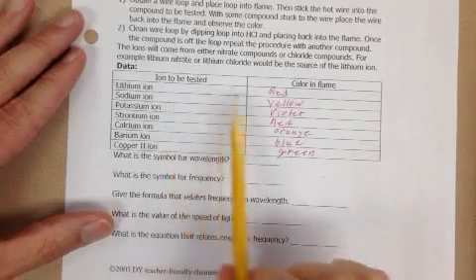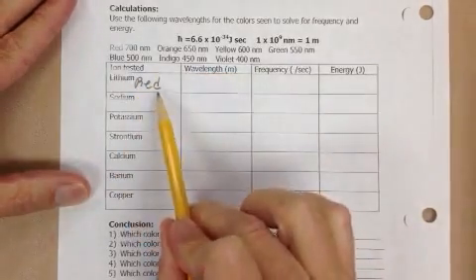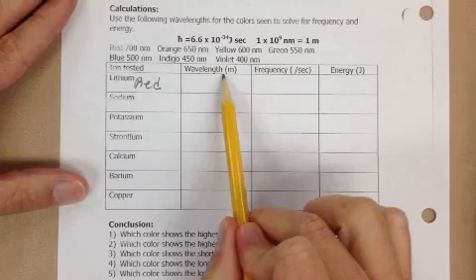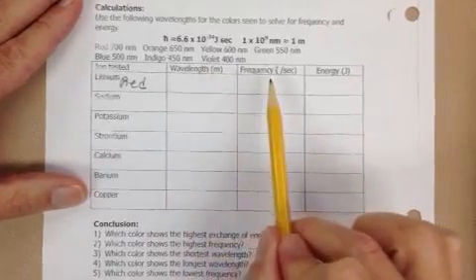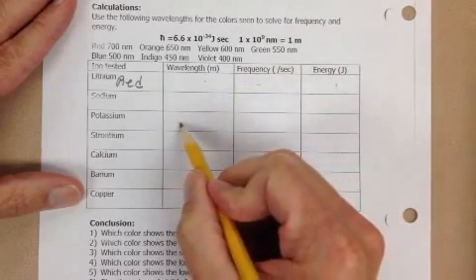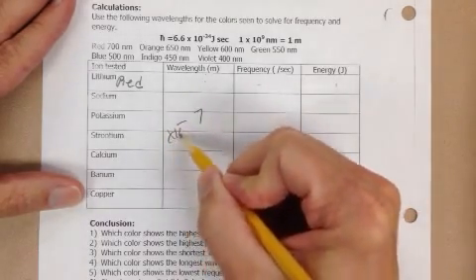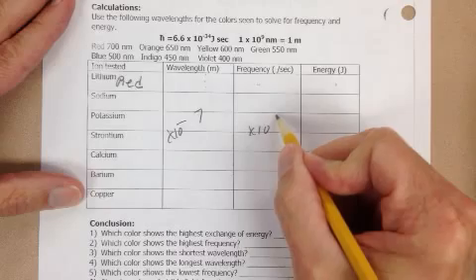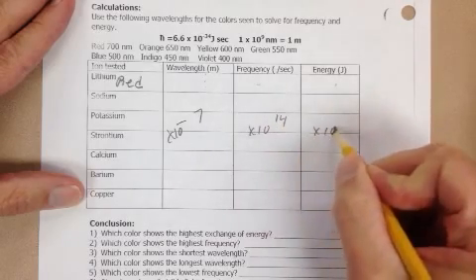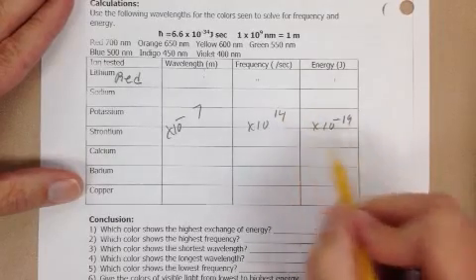we see go to the front. We see lithium is red. So on your lab, you come over here for lithium. You write the word red. You then change its wavelength to meters, just like we did, and then take wavelength and change that to frequency, and frequency to energy. Again, all of these answers should be times 10 to the negative 7. All these should be times 10 to the 14, and all these should be times 10 to the negative 19, or at least close. Negative 19, negative 18, 14, 13 should be close to that.